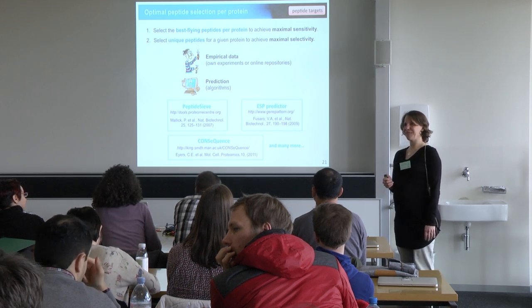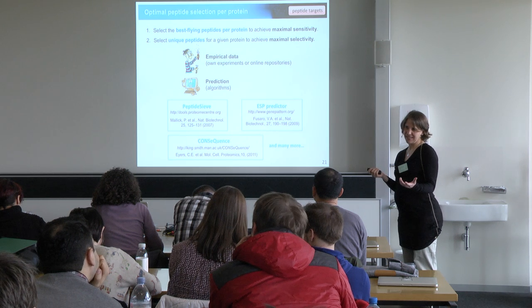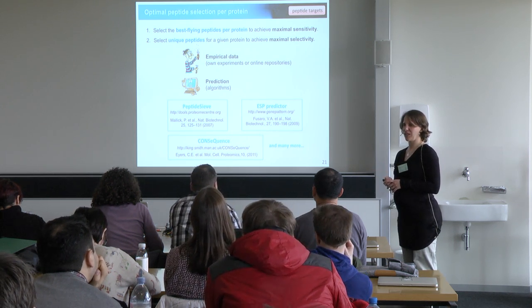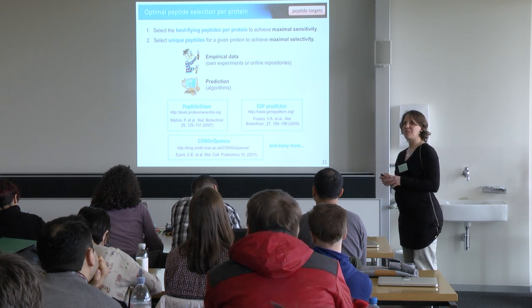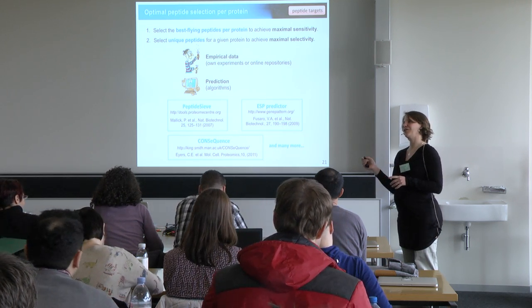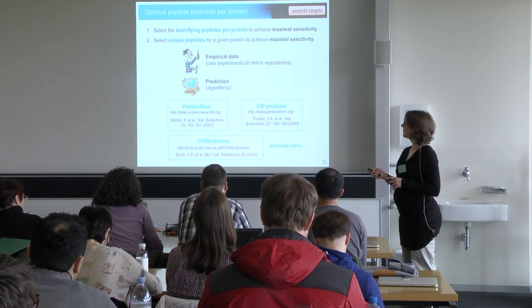Yeah, so usually empirical data is the way most people try to go, and it often makes sense to spend some time on finding these best peptides empirically rather than spending a lot of time on measuring something that is bad quality over many samples.